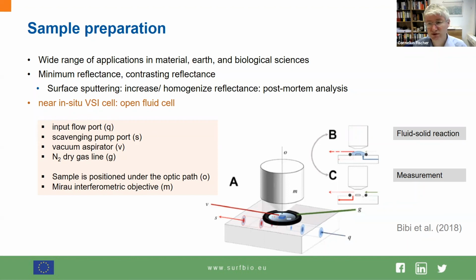There are of course also some hardware corrections in modern instruments where you modify the light intensity to circumvent such behavior. But usually if you want a simple measurement, you would provide more or less continuous reflectance of your sample.